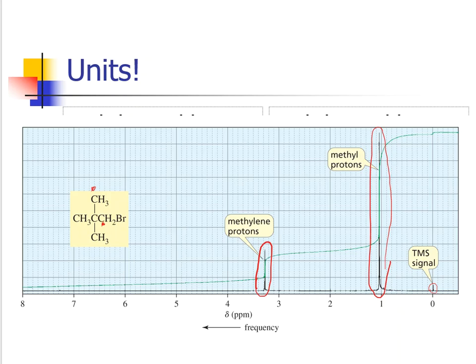So they're all the same equivalent set of 3 hydrogens, which means that this signal is in reference to 3 plus 3 plus 3. That's 9 hydrogens in total. Whereas this carbon and that signal are representative of only 2 hydrogens. All right, so 2 signals is what we would have said in that example problem. And folks, here we go. There is signal 1 and here is signal 2. So that is how we're going to start relating all of this information together.